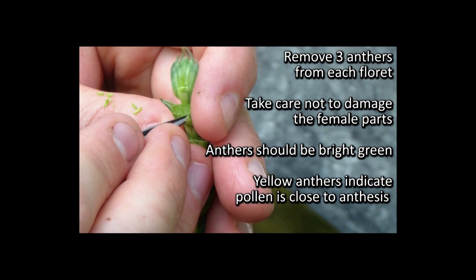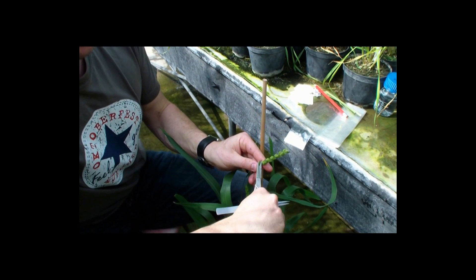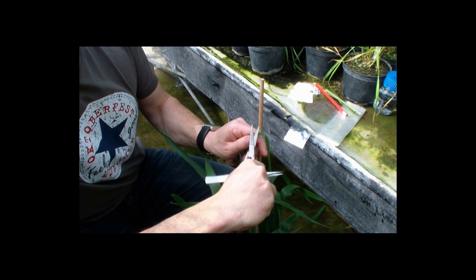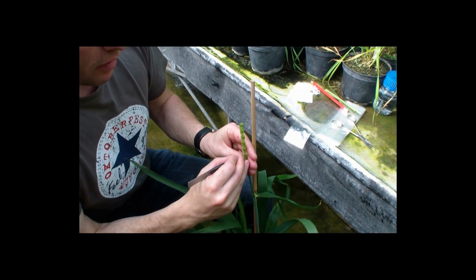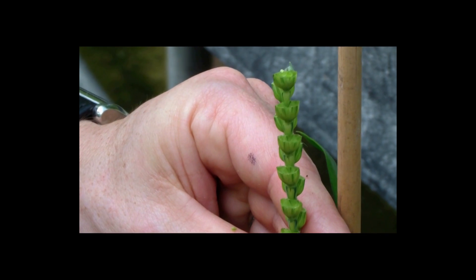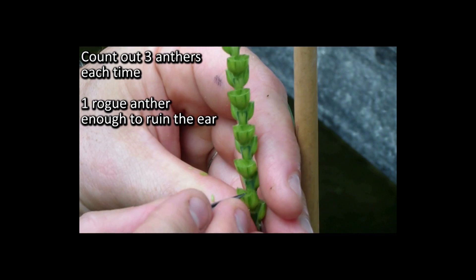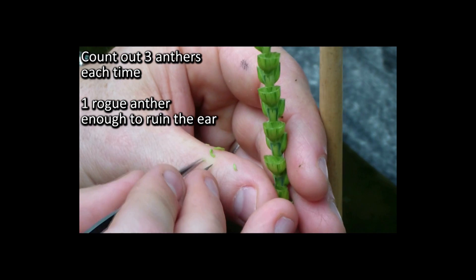We continue removing anthers. The central florets have been removed, we're cutting the tops off and going into each floret. It's possible to remove two or three anthers at one time, counting them out all the time. One rogue anther left in is enough to ruin the ear.